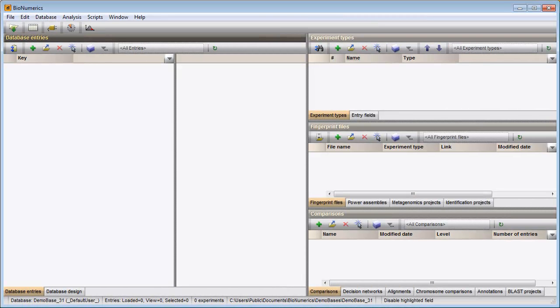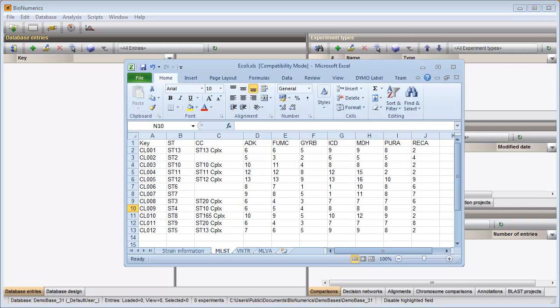In this video I will demonstrate how you can import character information from an Excel file into your database. I will import information from the following file.